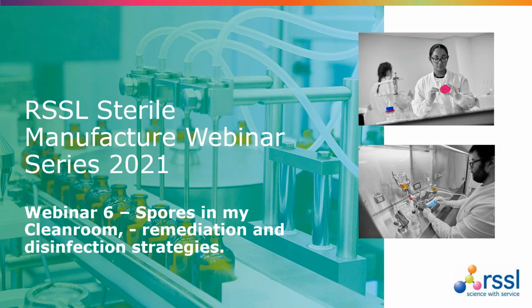Today's topic will cover spores in my clean room, remediation and disinfection strategies.